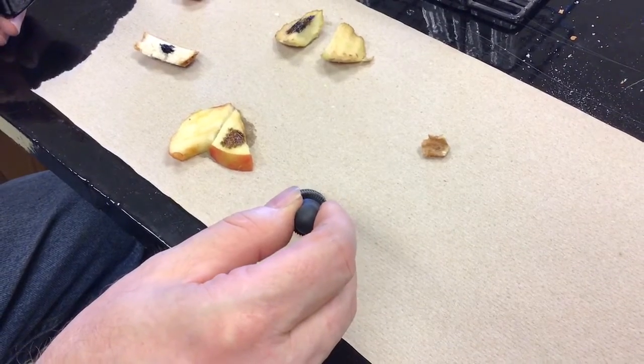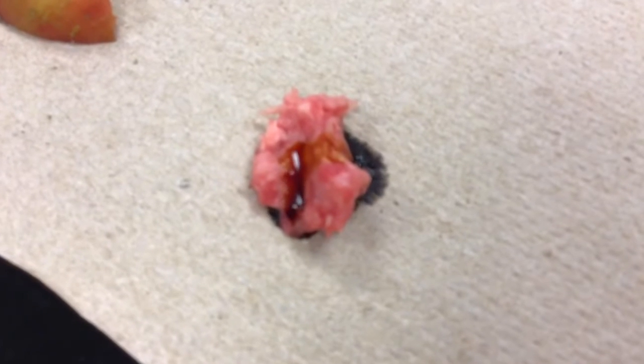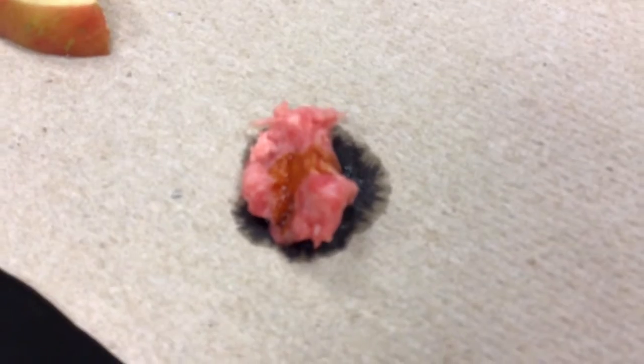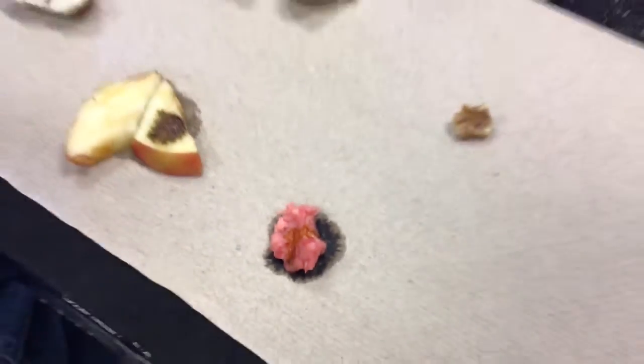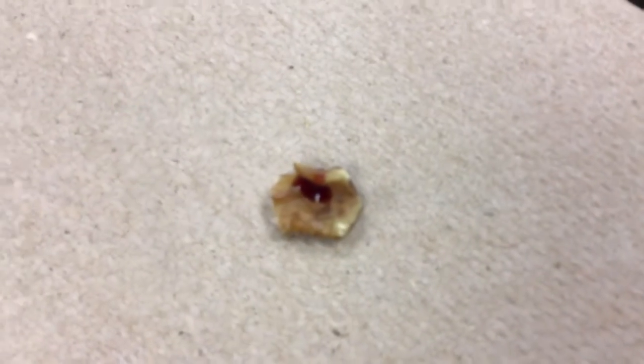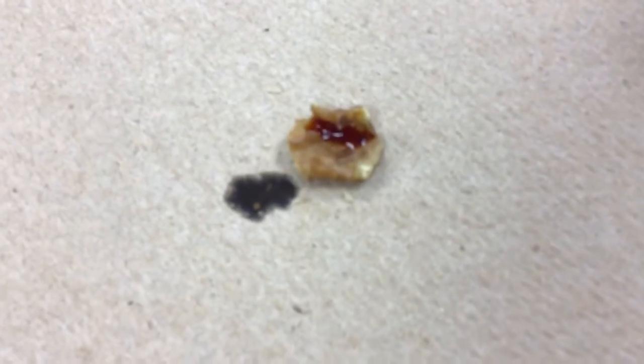Lugol's onto the meat. Soaks in pretty well. Turns the paper black for sure, but it does not seem to have changed the color of the meat. And onto the walnut. I may need to tilt that drop off so that it isn't a really thick drop, which is dark. Turning the paper black. Spread out on the walnut. I leave it to you to decide what you're seeing.